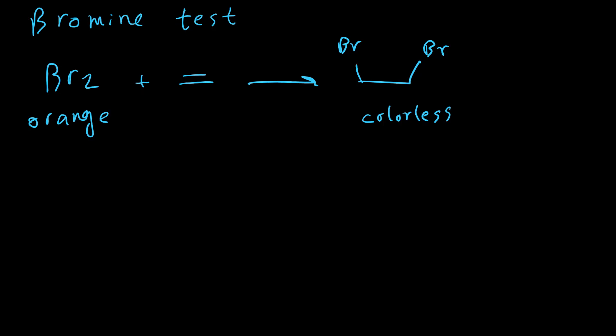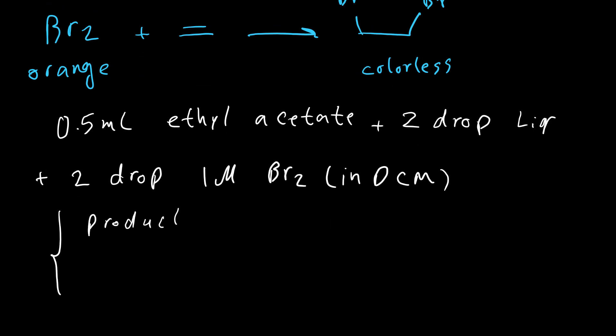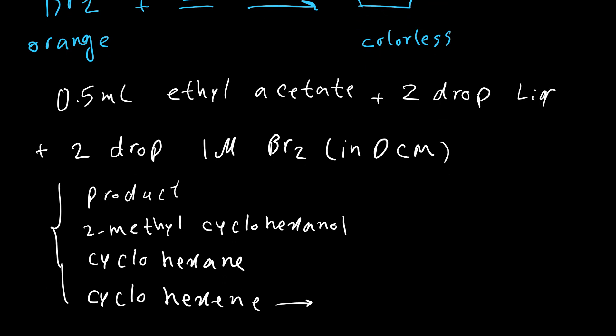For performing this test, we need to add 0.5 milliliters ethyl acetate inside a test tube. Then add 2 drops of organic compound, or I can just say 2 drops of liquid, and also 2 drops of 1 molar solution of Br2 in DCM. We are going to perform this test for our product, for our reactant which is 2-methylcyclohexanol, for cyclohexane, and cyclohexene. The last one is our reference for this test. Keep in mind, bromine is a toxic compound and also DCM is a very volatile solvent. So when you want to handle this reaction, always make sure it is inside the fume hood.